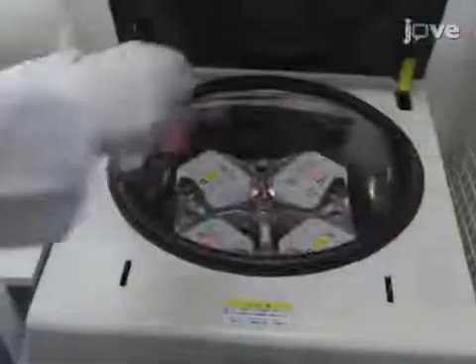Then collect and centrifuge the culture medium at 2300 × g for 5 minutes.